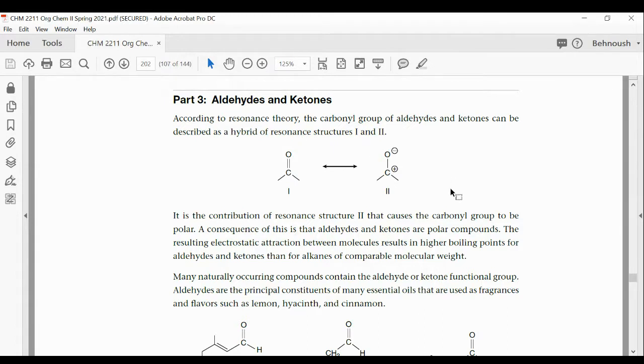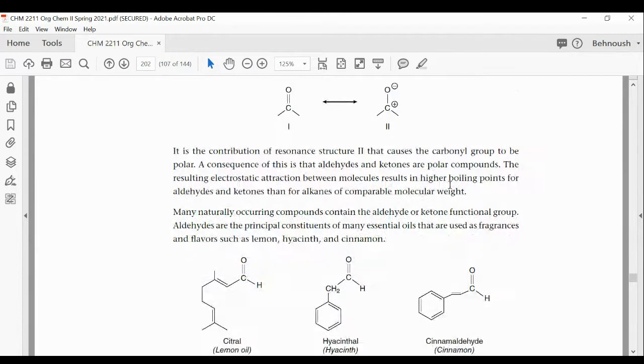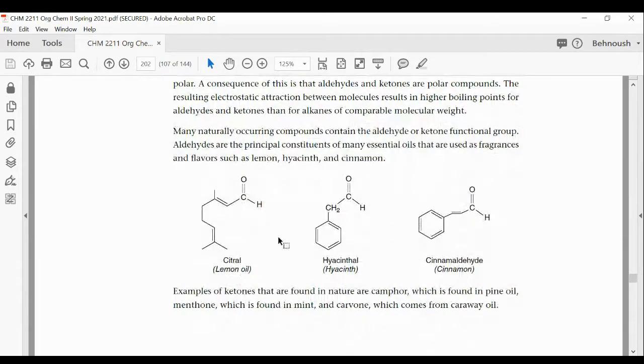And for the aldehydes and ketones, first you have to make sure that your compound is not an alcohol, not a phenol, not a carboxylic acid, which you approach with the solubility test. If it narrows down that your compound could be an aldehyde or ketone, then we can do some classification tests to see if it's an aldehyde or a ketone. If it's a ketone, is it going to be a methyl ketone or a non-methyl ketone?